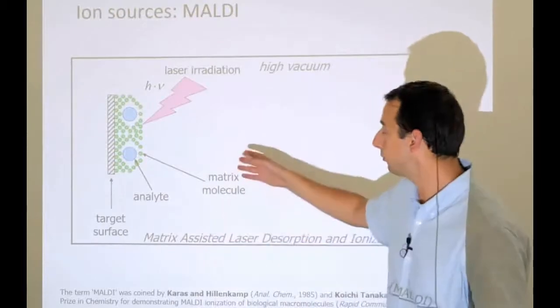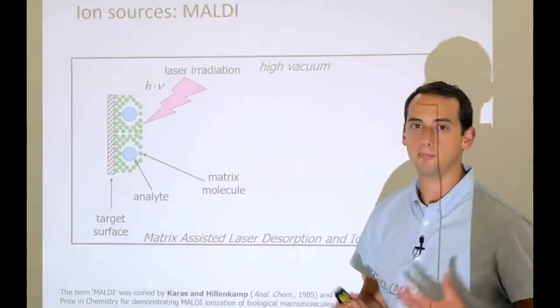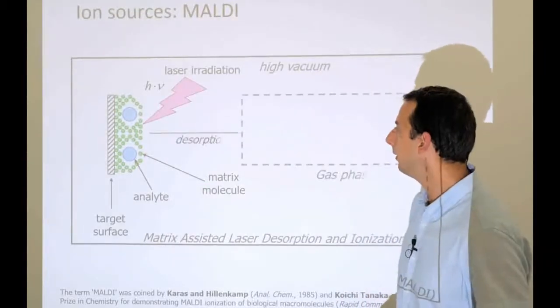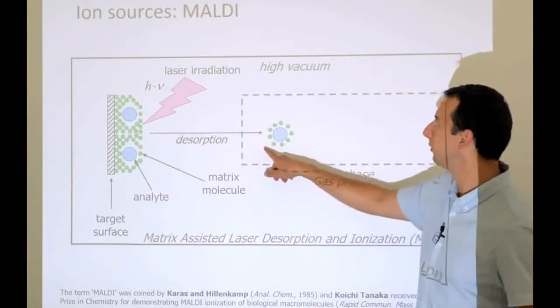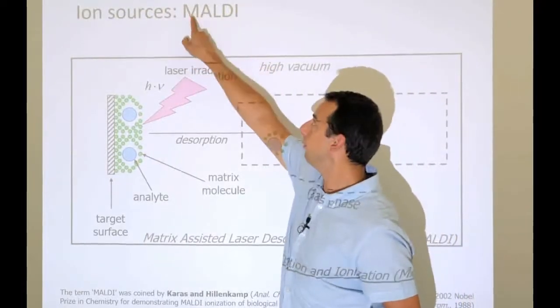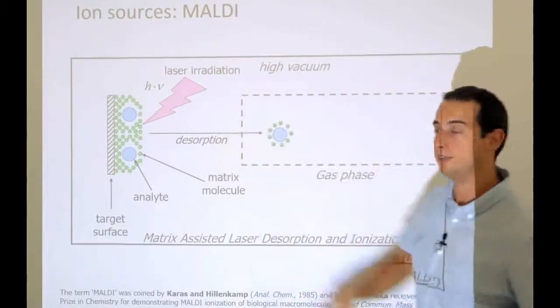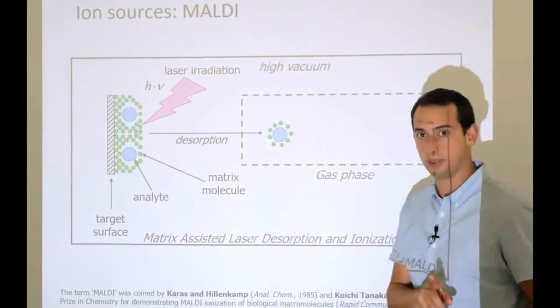Okay, so this is a bit like Star Wars. You're literally shooting lasers at a target, and the target blows up. Now, when that happens, this desorption phase, we now need to do the final bit of our MALDI acronym. So we've got the matrix that assisted us when the laser desorbed the sample. Now we need to ionize it. So here too the matrix is going to help.